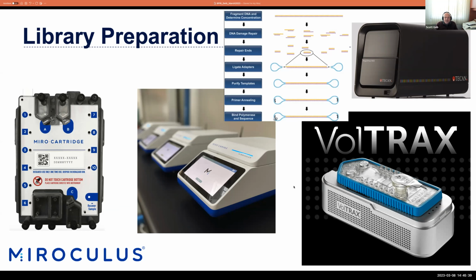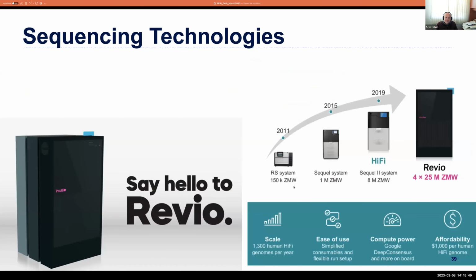Nanopore may be a little more approachable, and the way their kits are presented, you could do a rapid kit, which is very quick and only requires a thermocycler. It's using a transposon-based insertion for putting in the adapters. Some of the other things just take a while, so if you're trying to do it in a classroom.